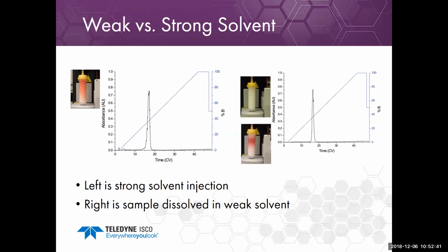Okay, another question. Is it possible to run this HPLC with solvents such as ethyl acetate and hexane since the compound comes in normal flash, 50%? I do not want to use high boiling solvents.